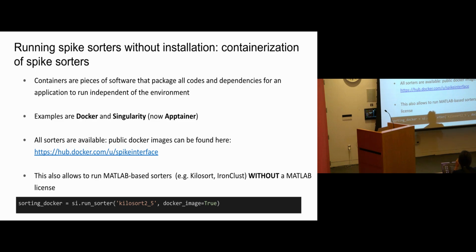Most of them have some spike detection method to do first. And then once you've detected your spikes, it maybe builds a template library or does something else. The idea of that module is it splits it into like 8 steps or something, and then you can configure that very finely based on your data. But that's quite an advanced specialist thing to do.